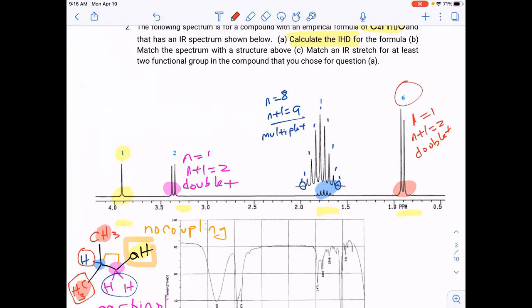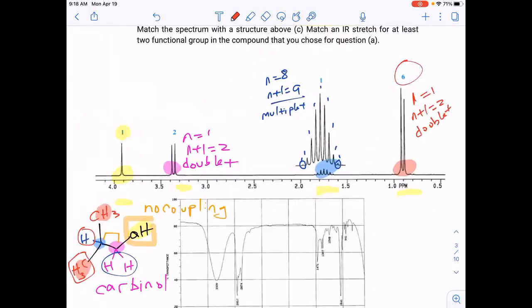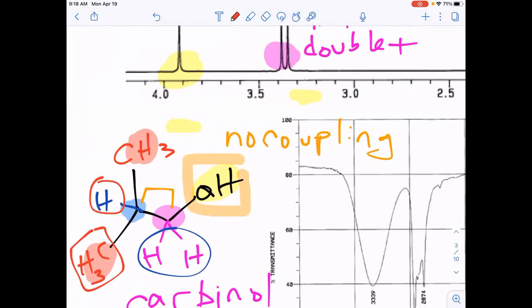And this isopropyl proton right here is showing up at about 1.8, right? That's easy to pick out, and it's pretty typical for an isopropyl type proton. You're going to see that anytime you see this type of motif, where you have a proton kind of hemmed in by two methyl groups, that's the splitting pattern that you're going to see, or something similar to it.